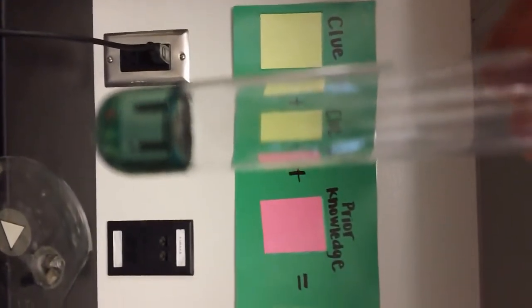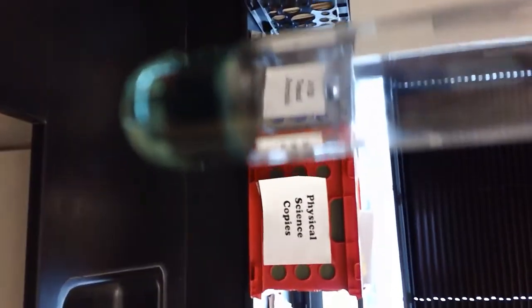Welcome back. So now I'm still on part C. I have added my 5 drops of K4FeCN6 and I have centrifuged. So we are recording our results now, our last results for test C. So first I have item CR. Okay, now I have item FE.